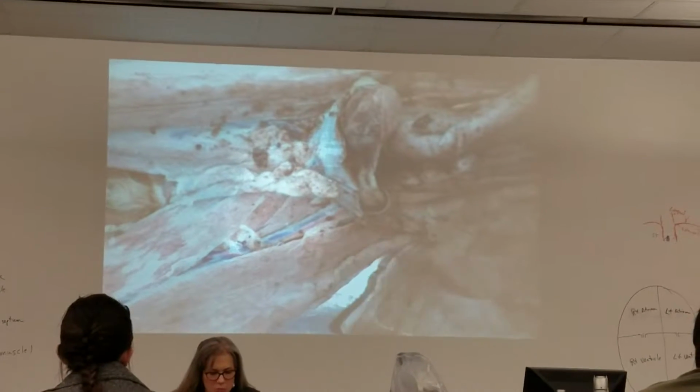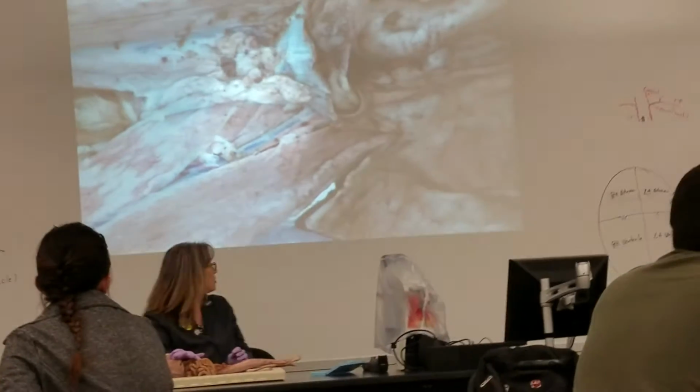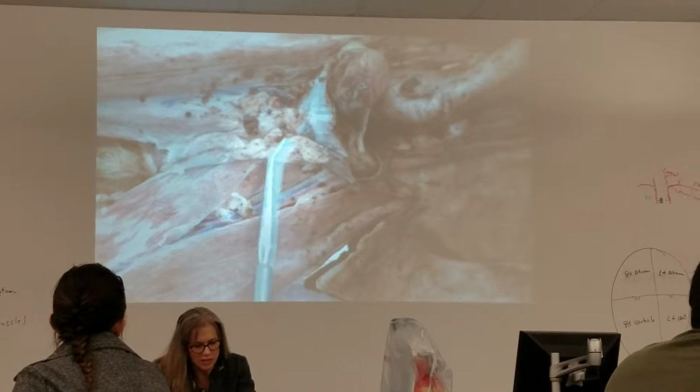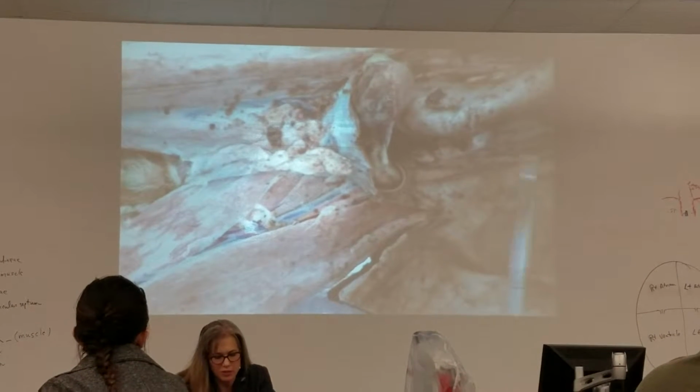Male reproductive system, so we're pretty much done here. We'll dissect out the male reproductive system on Thursday. All right, what you can see here, up here in the abdominal cavity, we just have a couple that are going to be found down here, and then we're going to go on the leg, and we'll be done in 10 minutes. This right here is a nice ureter.